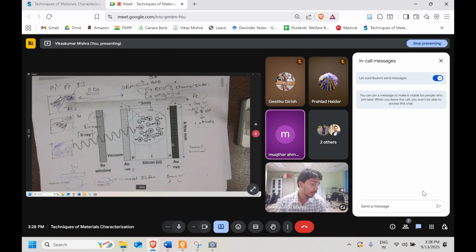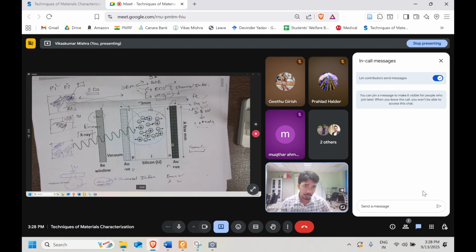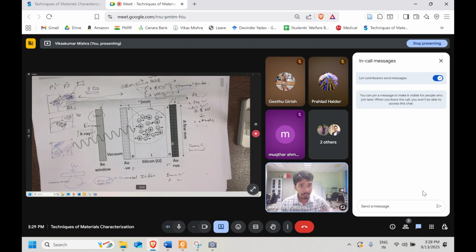Yep, very good. That's a nice question. First of all, the beryllium window should have certain strength, because the specimen chamber will mostly be under vacuum. Second thing is that it should absorb, let's say our specimen has a lot of moisture. Whenever the electron beam hits, heat might be generated and that moisture will go. So our detector should not get damaged.